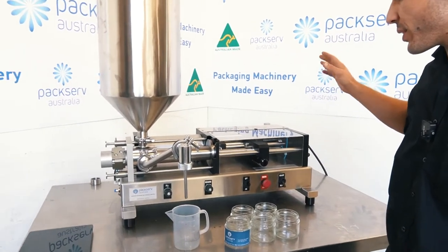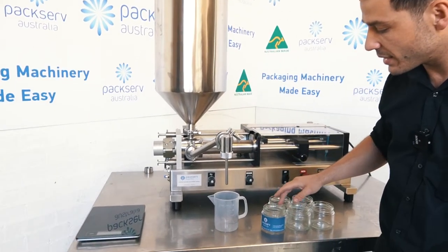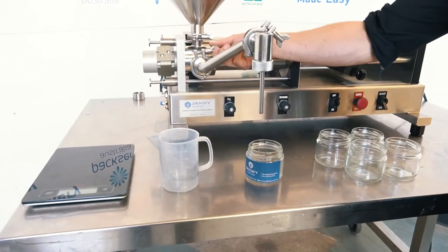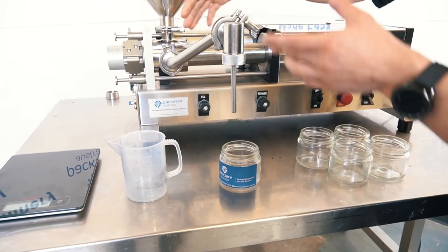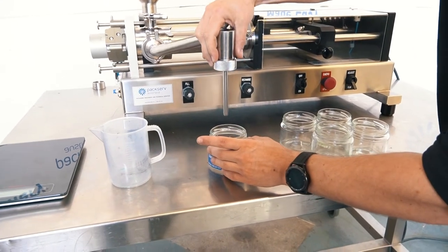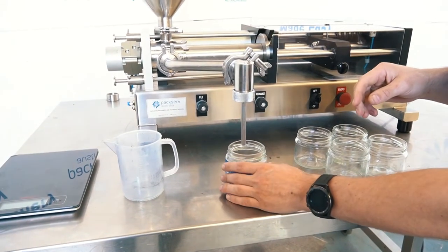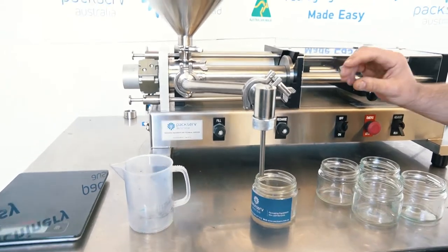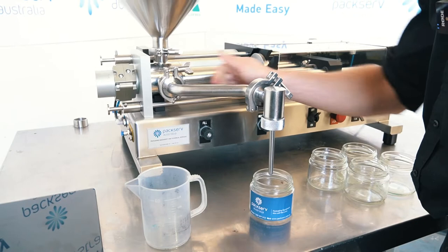First step is to make sure that my nozzle height is going to be at an appropriate height for my container. The way to do this is to loosen these triclamp clamps here a little bit, which will allow me to angle this down. What I want is to be able to slide my container in nice and easy. If there's a tiny little drip there, I want a little bit of clearance — generally five mil above the lip of the container. Then tighten that back up.